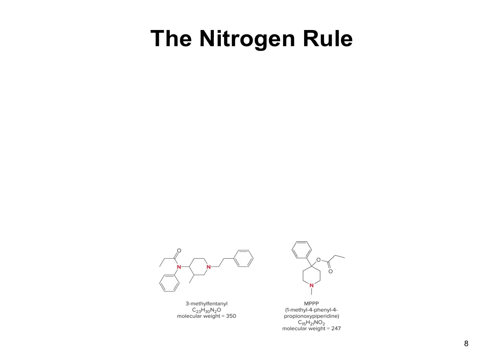Now, hydrocarbons, as well as compounds that contain only carbon, hydrogen, and oxygen atoms, are always going to have a molecular ion with an even mass.